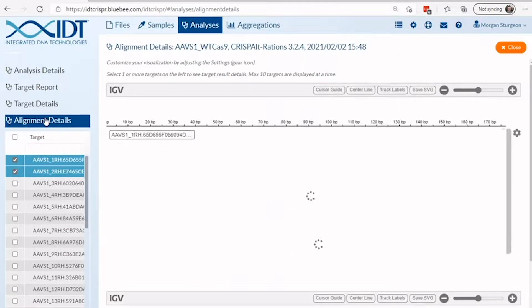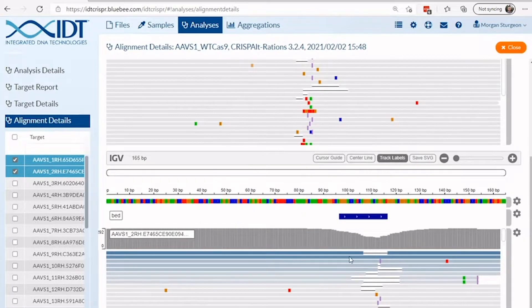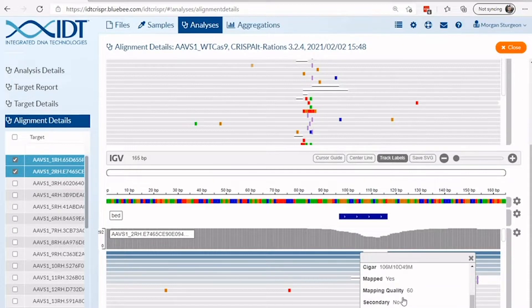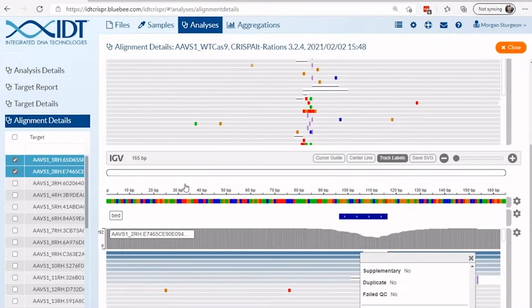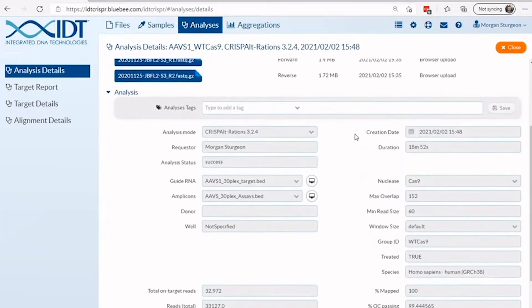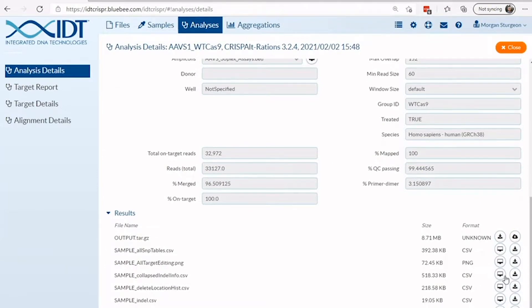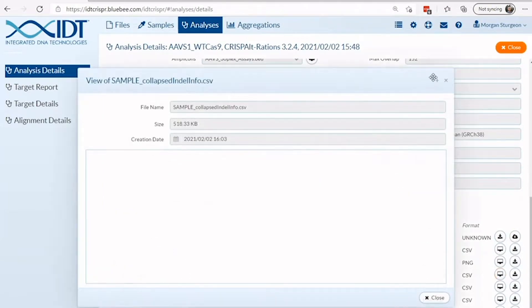By navigating to the alignment details page, you can view the distribution of alleles in the sequence population using IGV. The frequency of the event and read count can easily be obtained by clicking on the event of interest and looking for the AF or FQ tags. For end users with novel graphical needs, raw data can be downloaded by clicking on the analysis details page to view general sample information and an assortment of files for custom needs.